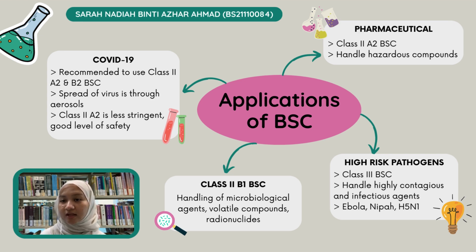The selection can be done by conducting a risk assessment on the pathogens that will be dealt with. Infectious aerosols can be generated from aliquoting, vortex mixing, centrifugation, and pipette usage. These aerosols can also be generated from pressurized containers that are being unlocked and through the separation of specimens.